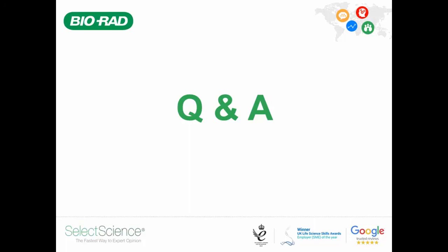Thank you, Andrea. Our next question asks, you have created a nice method combining the sorting of T cells with digital PCR. What experiments are you planning to do next?